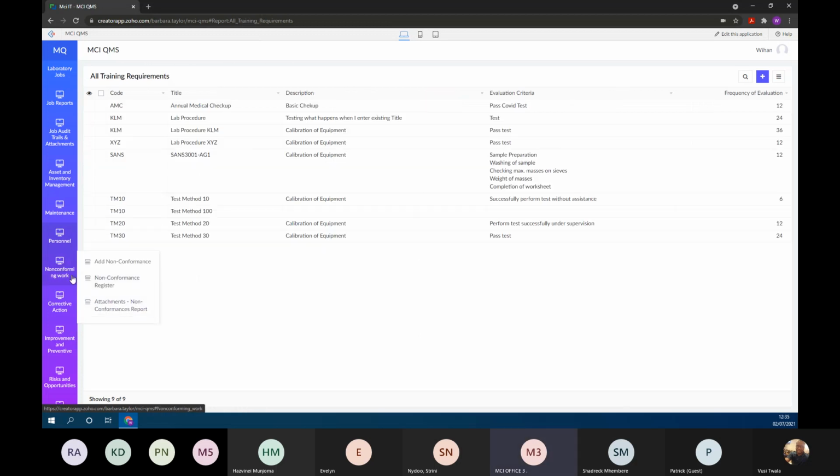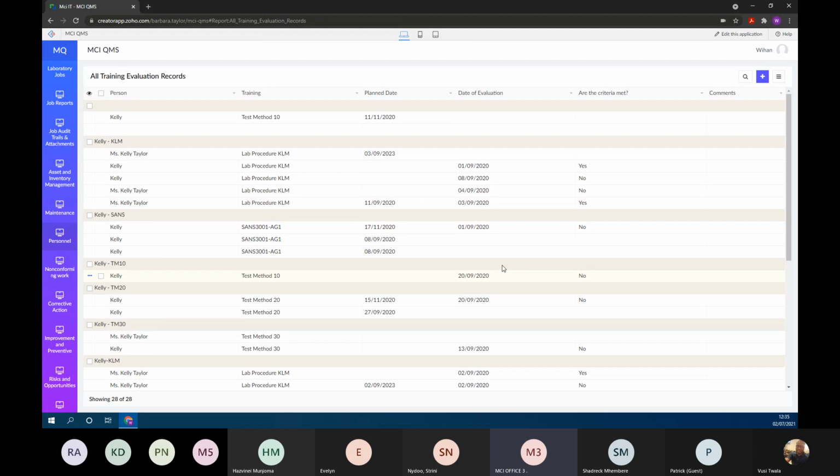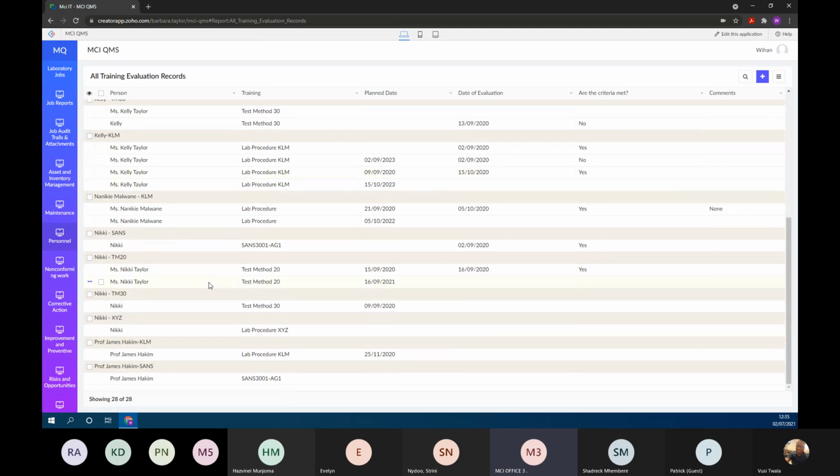Sorry, not that one. So this is essentially the list view of the calendar we were previously looking at, and the system starts to manage that going forward. Once I've done the first one, the system takes over from there, and it schedules the recurring events.